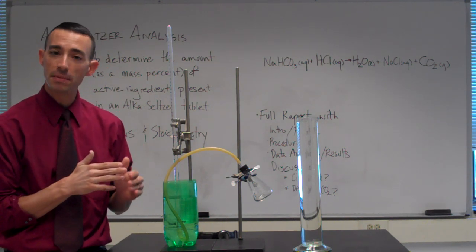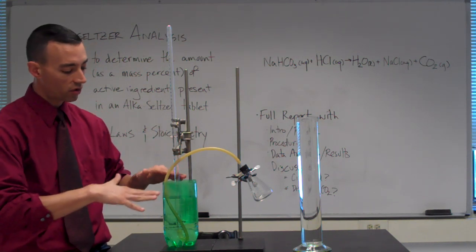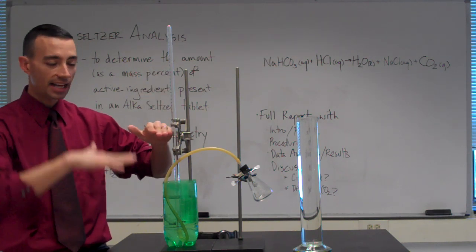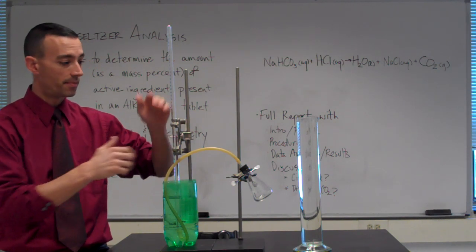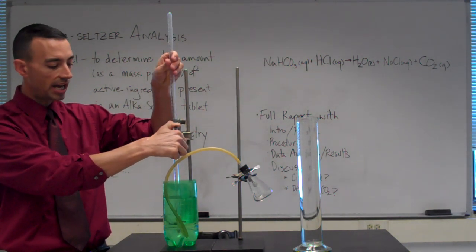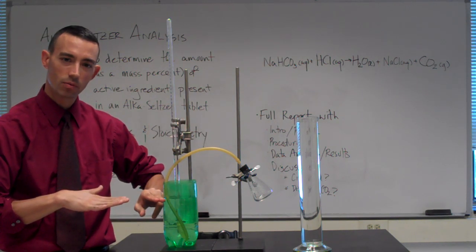This is a lot like a manometer, which we've talked about in class. You could think of it as a seesaw again. And clearly the water levels show us that the pressure inside is less than the pressure outside of our burette. So we need to equalize them. If you're lucky, you'll have produced enough gas that you could just slide your burette up and down until the level of gas inside and outside are equal.